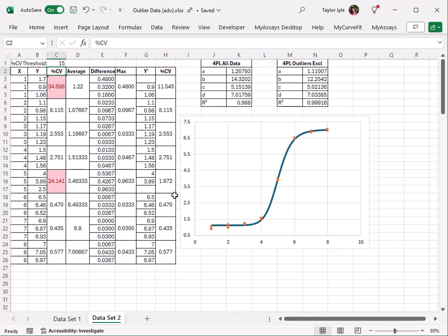For more information on how to configure these automatic flagging functions, please see the below video.